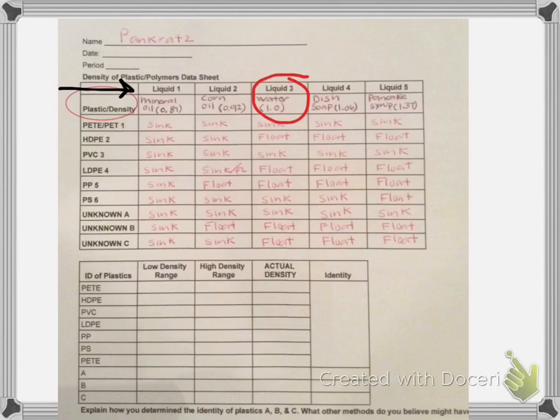Now, if we look at the middle part of our table, we're going to notice that we have PETE filled in, HDPE, PVC, LDPE, polypropylene, and then along with our A, B, and C unknowns. And you were asked to put in sink or float. So we noticed for my PETE, all of them sank. So you should have gotten something like that as well. Hopefully all of your PETE sank. My HDPE, I have 2 sinks and 3 floats. For PVC, very similar to PETE, I have all sinks.